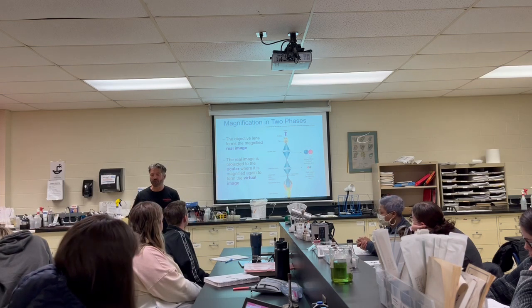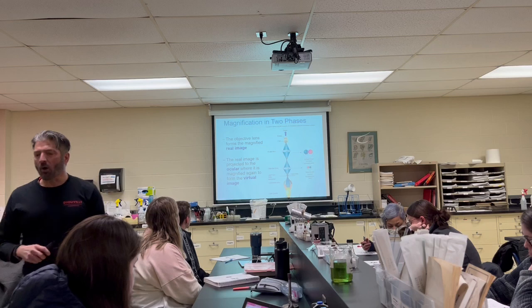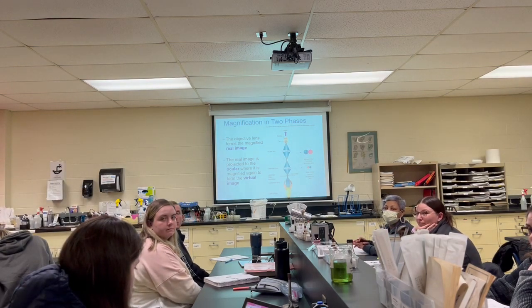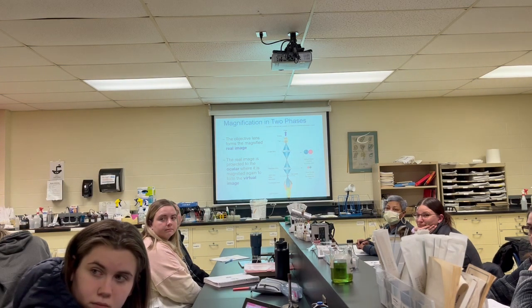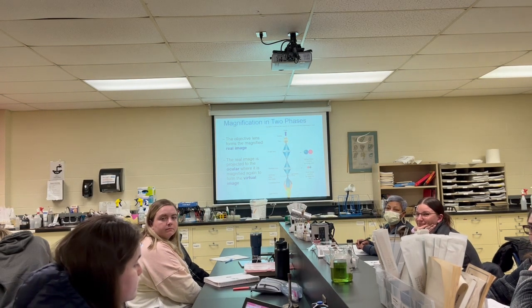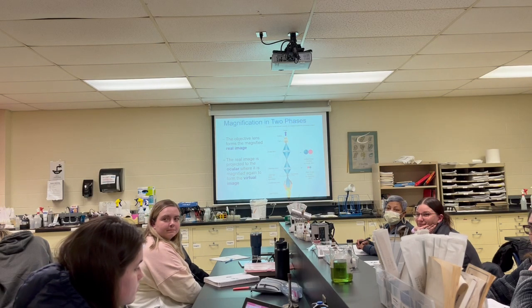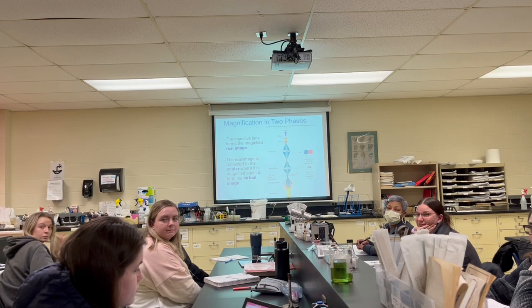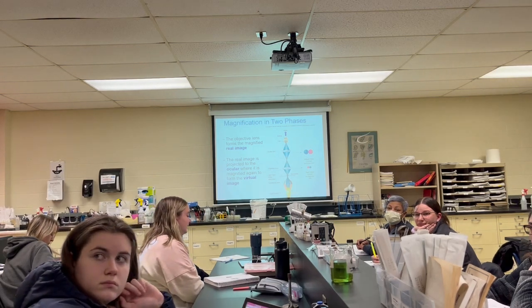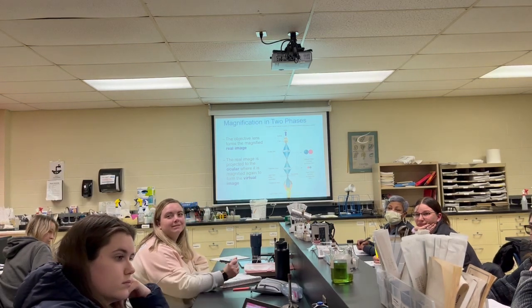By the way, before I forget, for anyone who has false eyelashes in here, these are called demodex, and they love to live in your eyelashes. They love to eat the glue that holds your eyelashes on. So I bring that up because if you go to use a microscope, there are alcohol wipes, please wipe the ocular off.